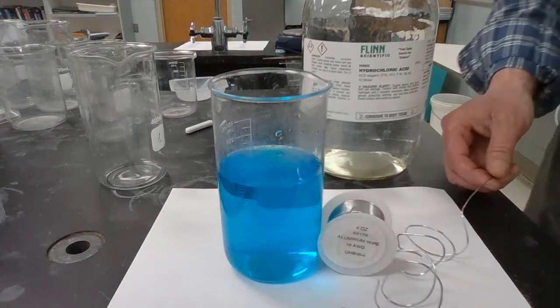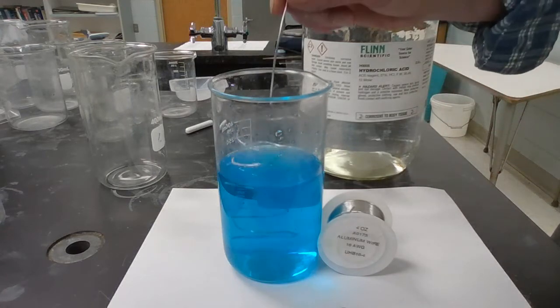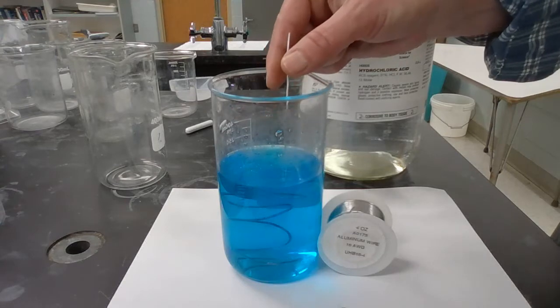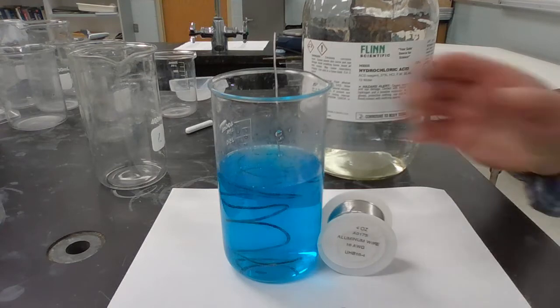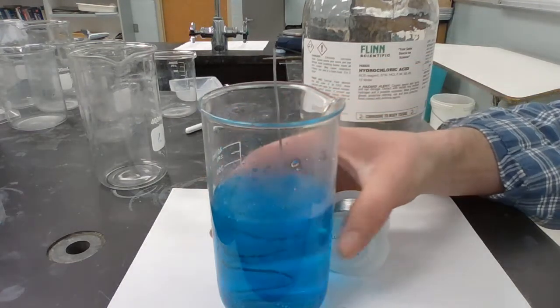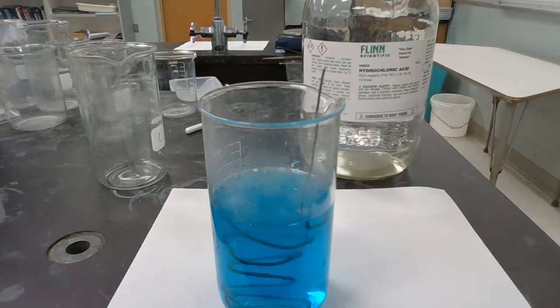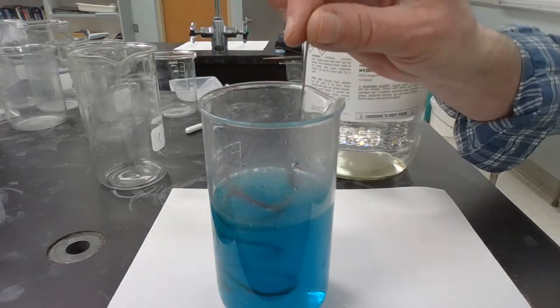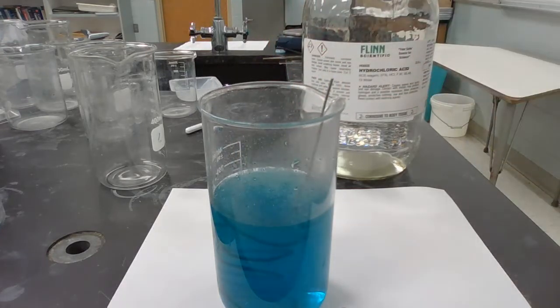All right, for our last step, we're going to take some aluminum wire and stick it in there. We see right away that it's bubbling pretty strongly. And so we'll let this go a little bit and then we'll come back. It's also the wire's turning dark and bubbling. Looks like we got some brown stuff on the wire. So yeah, we're definitely getting a reaction out of this.